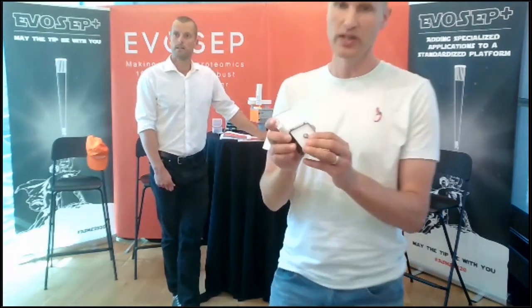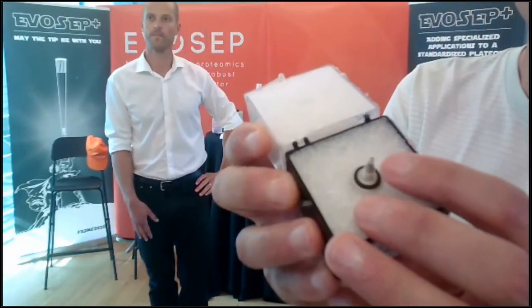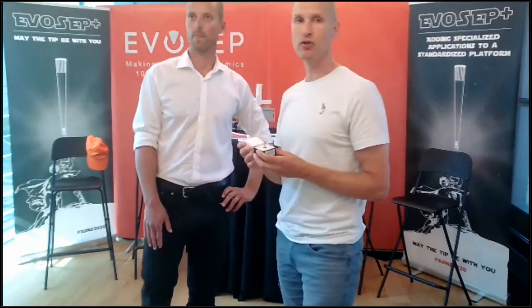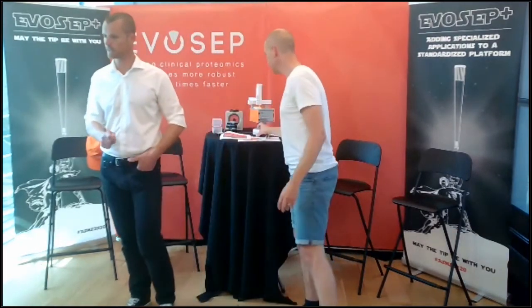It's a metal one. So if you are running Bruker instruments, you should carefully look out that you want this exact piece here, instead of the traditional one, which has a PEEK ferrule and PEEK ending. That's the way you can see the difference, right? I actually think it's also on the slide, if we can get the slide back.